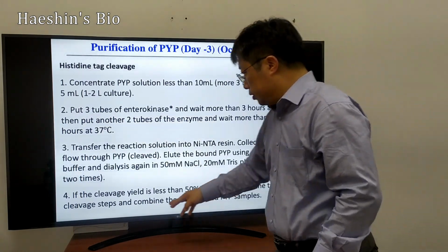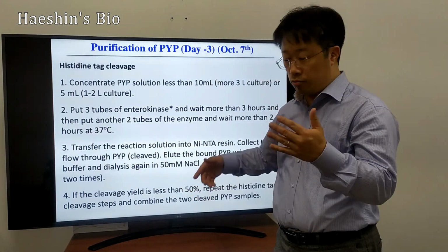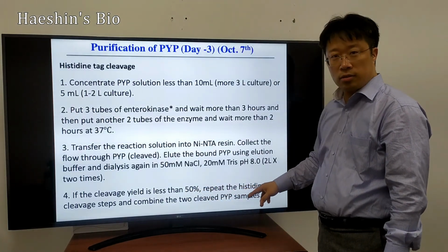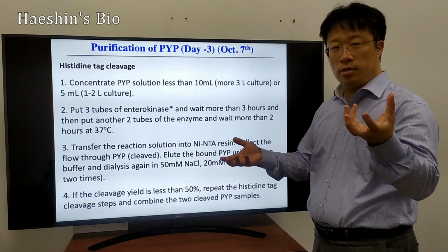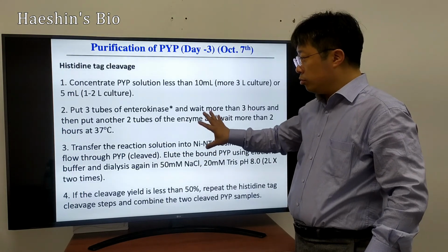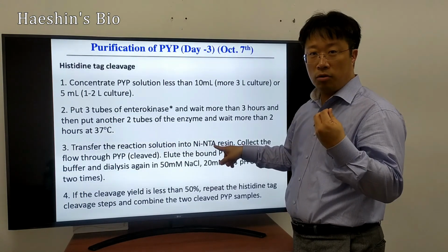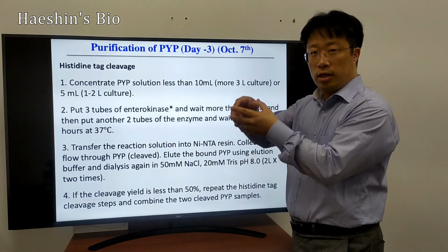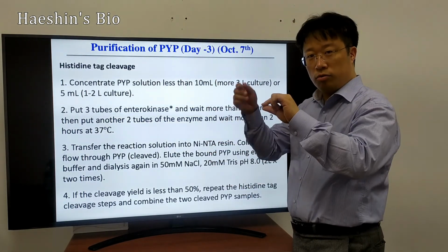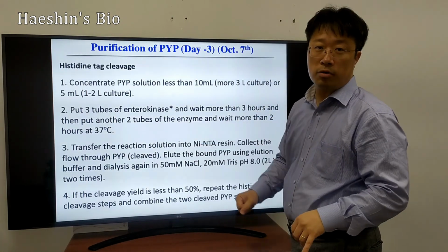If the cleavage reaction is very low, for whatever reason, then you have to repeat this process again. You collect the first fractions and the second fractions, and then go to the next step. The good thing is, if the enterokinase doesn't cleave it, that protein can still bind, and then you elute it with imidazole. You collect it, dialyze to remove the imidazole, concentrate a little bit, and then load it again to the enterokinase solution, cleave it again, and repeat this process.